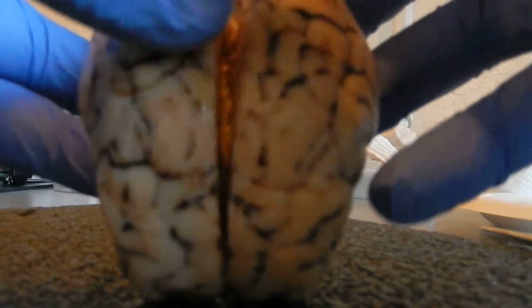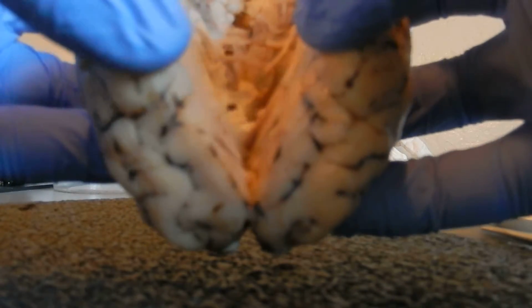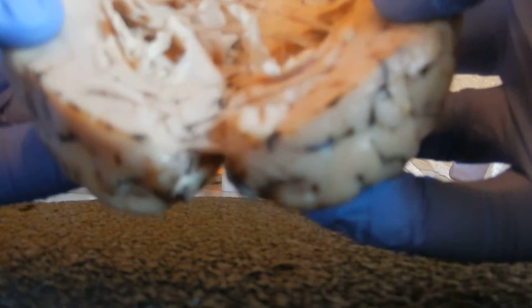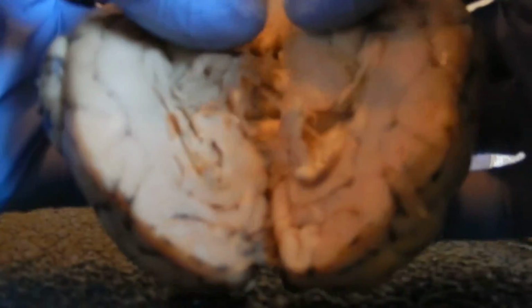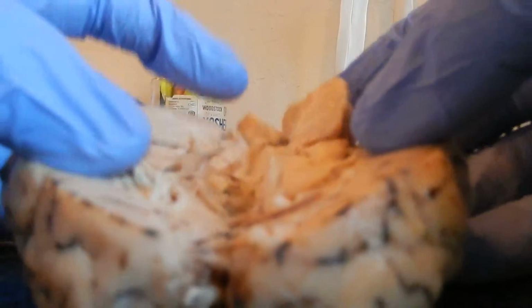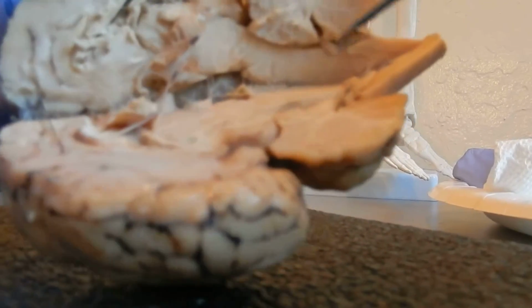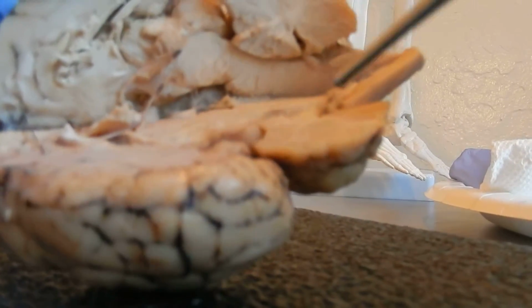Alrighty, let's see our sagittal dissection. Going to open up our brain here. That's a beaut. So we go deeper here with our sagittal dissection.